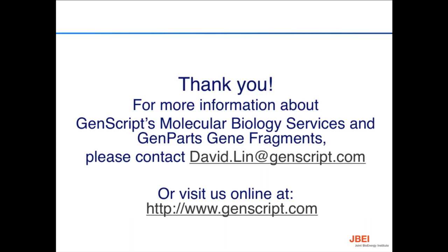The Teslagen app right now largely supports any of the flanking homology types of methods. It can support things like the type 2S methods like Golden Gate, combinatorial things, all those types of things. There's some really interesting work there. They're increasingly going to be supporting hierarchical design.